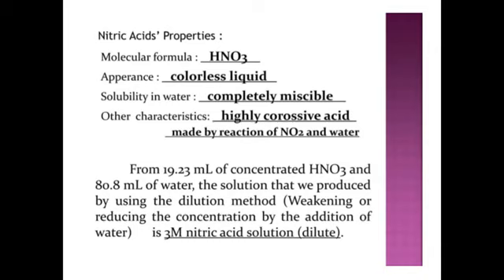So you have been able to prepare 3 molar in 100 centimeter cube. Please take note, the question says 100 centimeter cube. That's why we make it up to 100 mL, because 100 centimeter cube is equivalent to 100 mL. There is specific information that was given there. Take note of that. So that's how to prepare that.